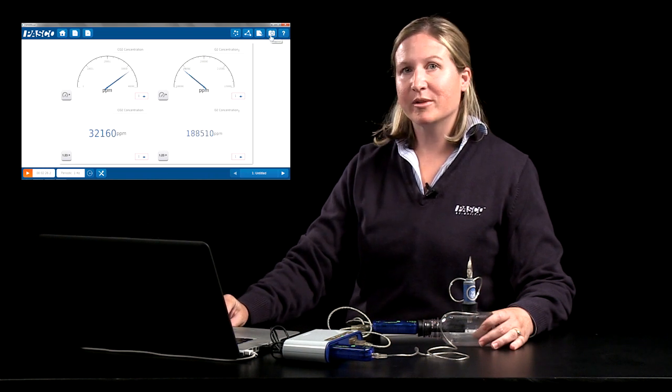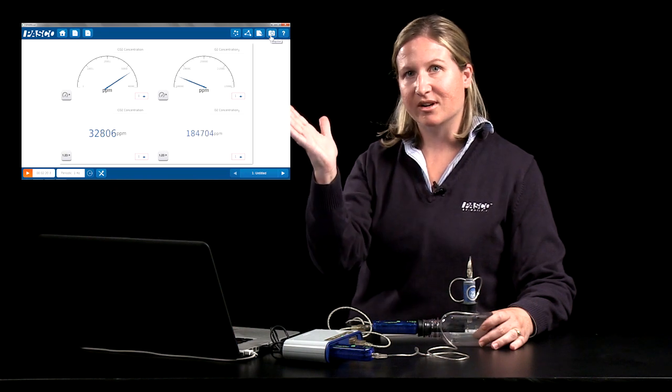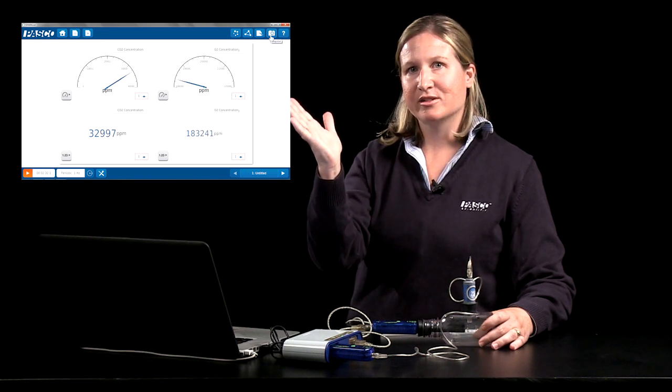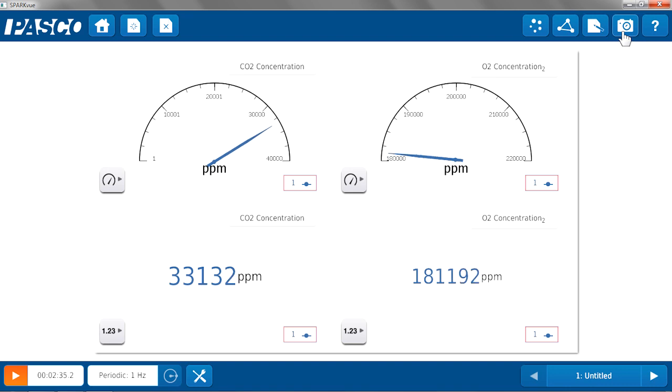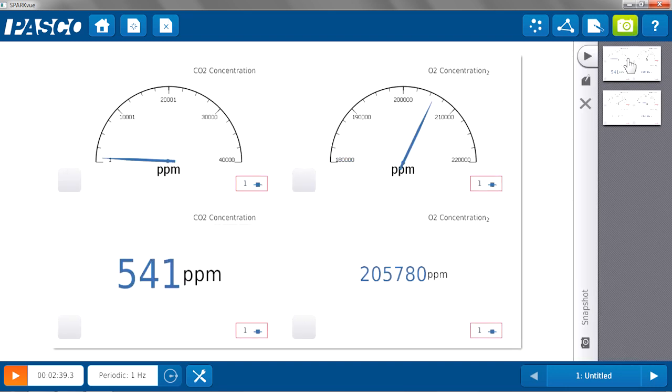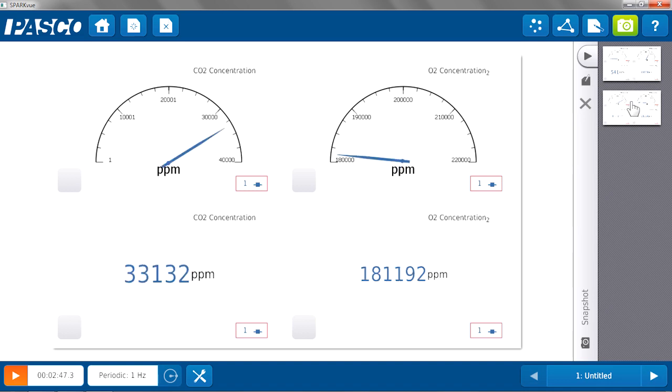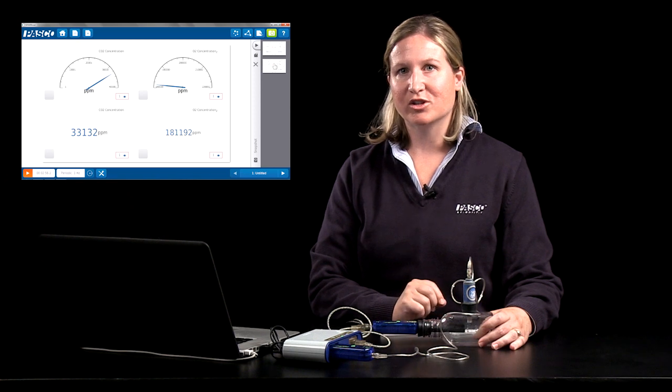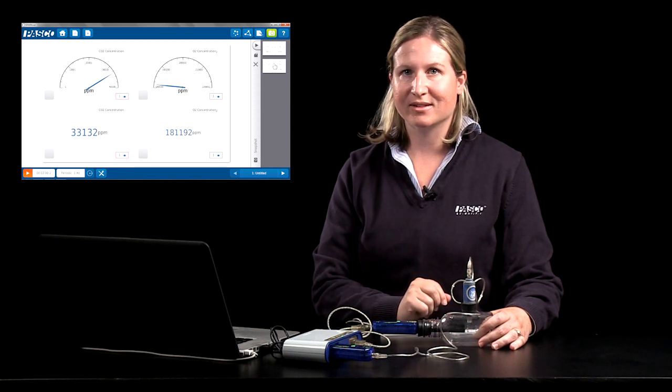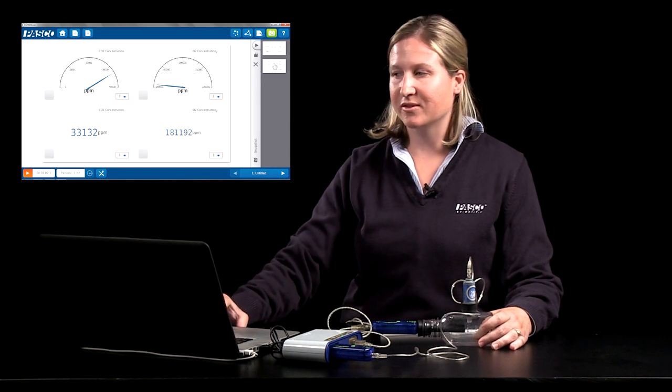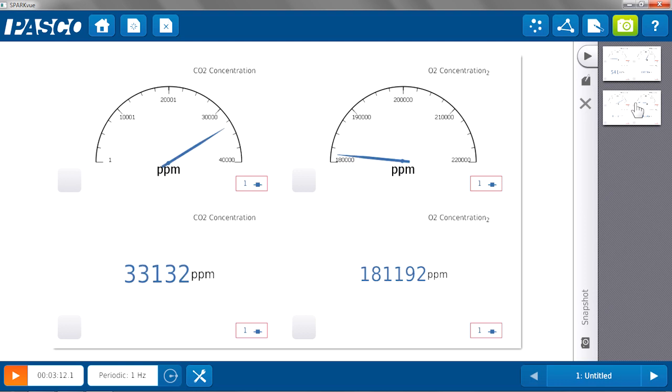So students will probably notice that the carbon dioxide meter showed an increase in carbon dioxide and the oxygen showed a decrease in oxygen. And taking a snapshot we can compare those initial and final values. So I started with 541 parts per million of carbon dioxide in that sample of room air. And you can see for my sample of exhaled air that it went up to 33,132 parts per million. So students can see that the difference in concentration is not just a little bit between the air and their lungs, but the difference is significant. They can also do a similar comparison for oxygen. Initially starting out at 205,780 parts per million. You can see the needle go down and that concentration of oxygen was less in their exhaled air, only 181,192 parts per million.